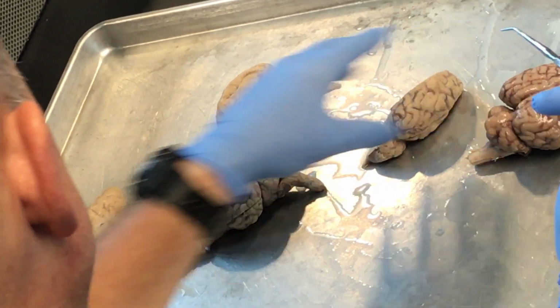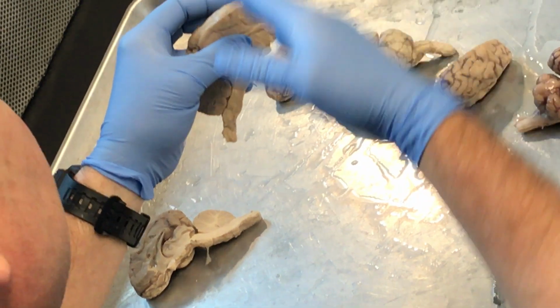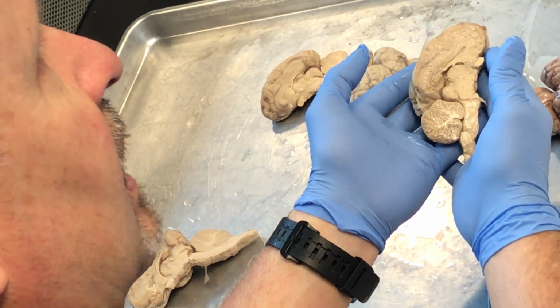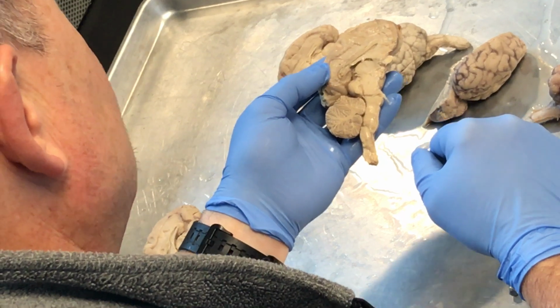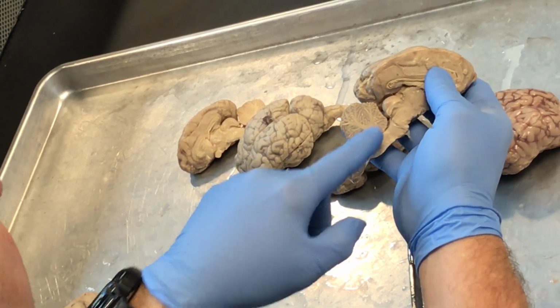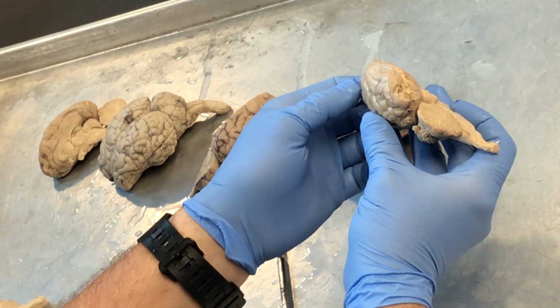Now this is a mid-sagittal cut. This is also a mid-sagittal cut. What we will not do is, because we have some cuts like this through the brain, we will not put those on the test. You'll only see this type of presentation and a presentation like this: full brain or mid-sagittal cut. What I'd like to show you here with the cerebellum is this thing right here. It looks like a little bush, doesn't it? It's called the arbor vitae, which means tree of life. See a little bush right there? Okay, arbor vitae, tree of life. Alrighty?